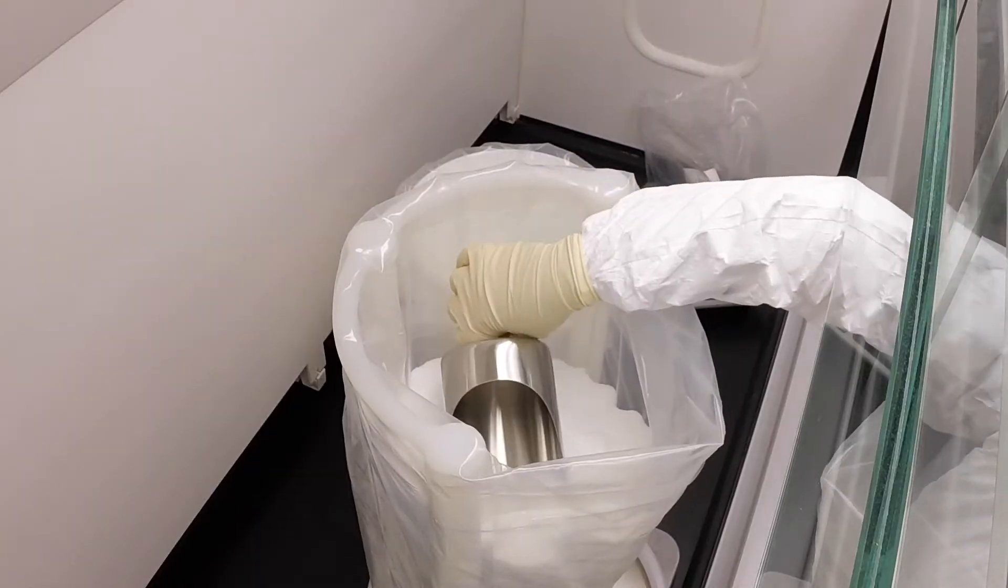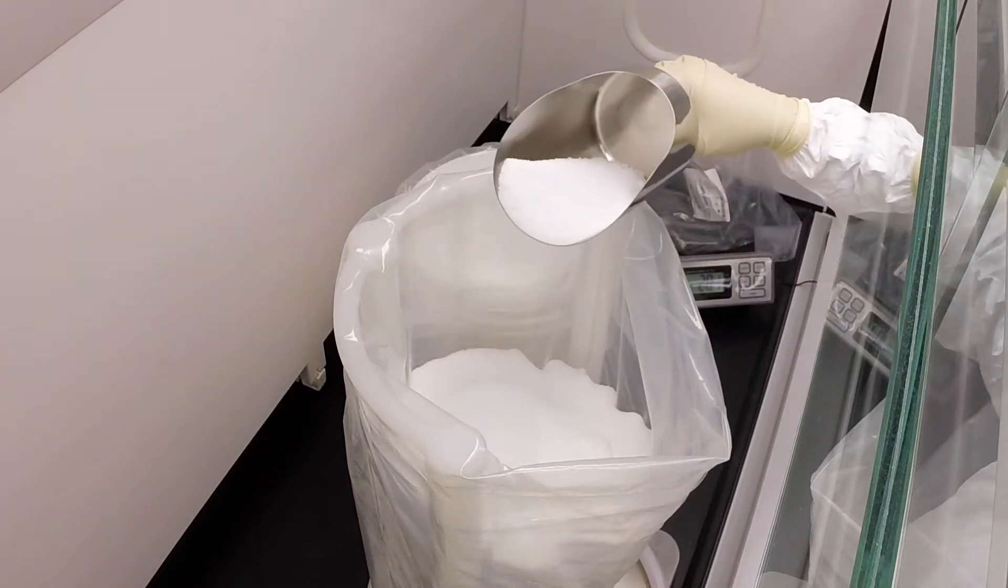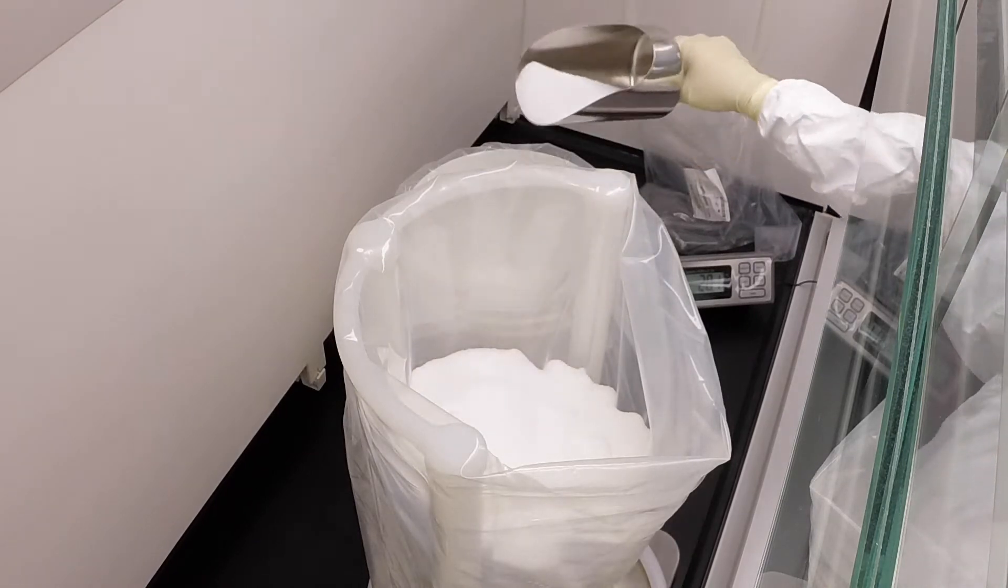How do we accomplish that? First, our system was designed and built specifically to handle powders. It wasn't derived from some existing liquid handling system.